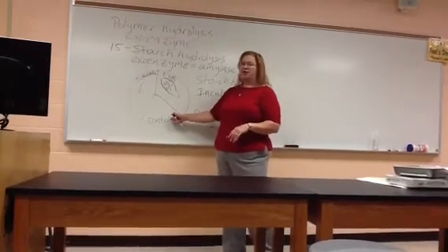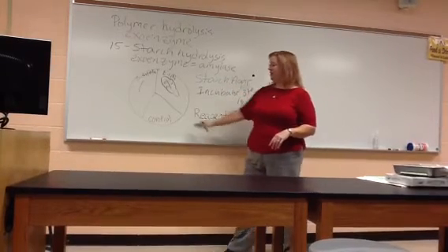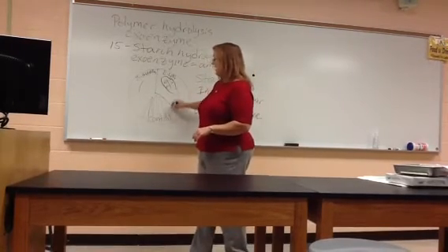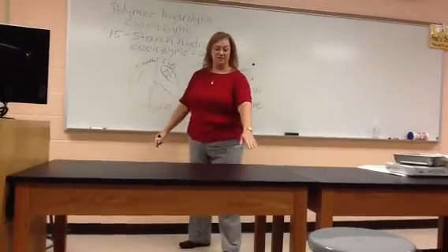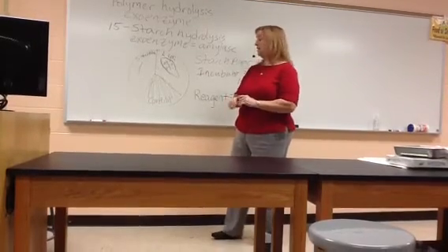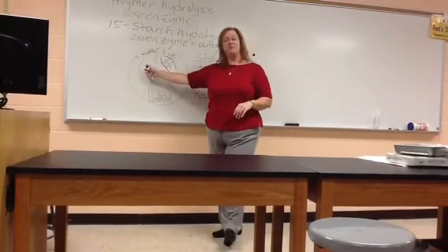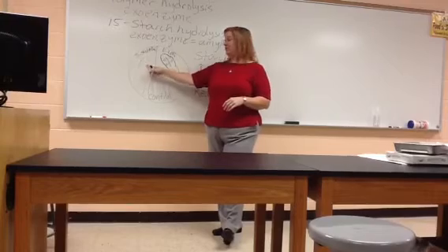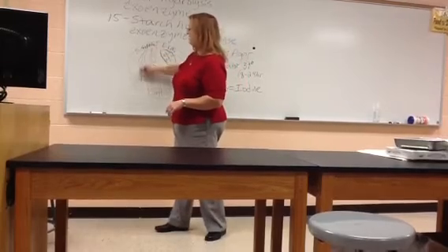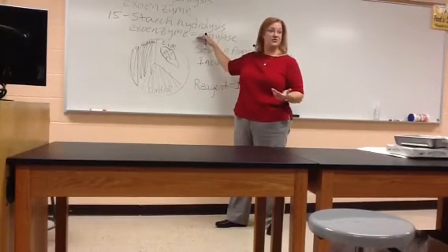So this control section of the plate, you didn't put any bacteria in. It's just starch agar. So when you add iodine, what should happen to this section of the plate? It should turn black, right? There's no bacteria in there, it's just starch agar. So this bacteria, in this hypothetical example, didn't produce amylase. So should there still be starch around them? Yes. So what color is that going to turn? Black. You're going to have black color all the way in that section of the plate, because that bacteria didn't produce any amylase, the starch wasn't destroyed.